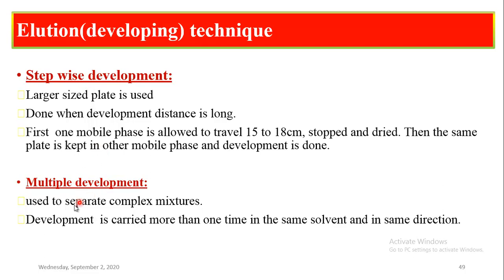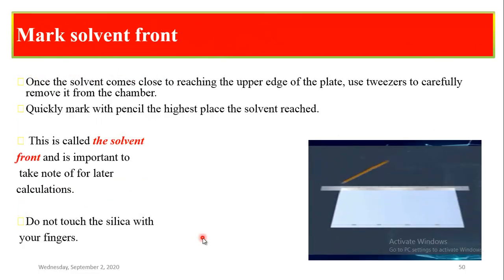Multiple development is used to separate a complex mixture. Development is carried out more than one time in the same solvent and in the same direction. That is called multiple development. So these are the developing techniques used for the separation of components.